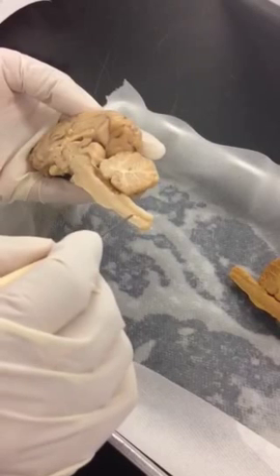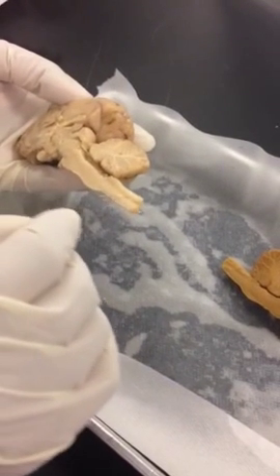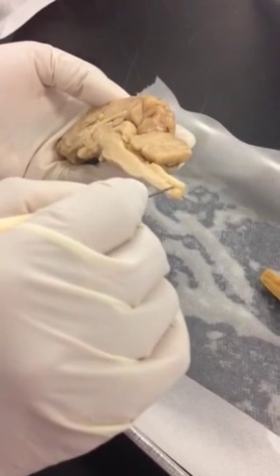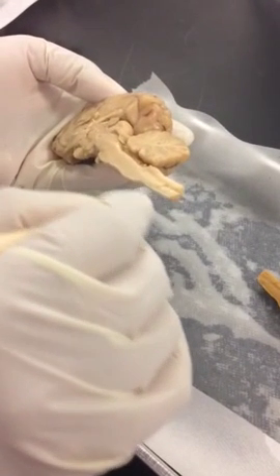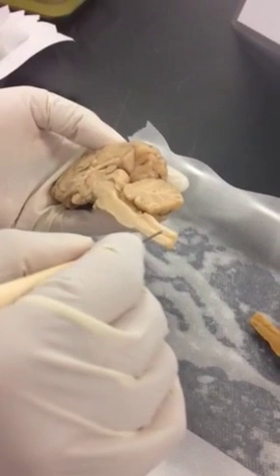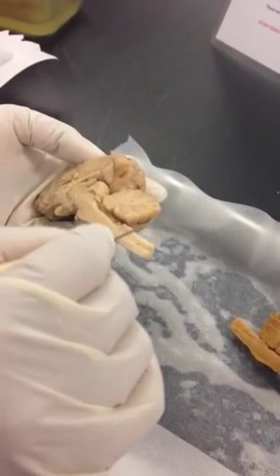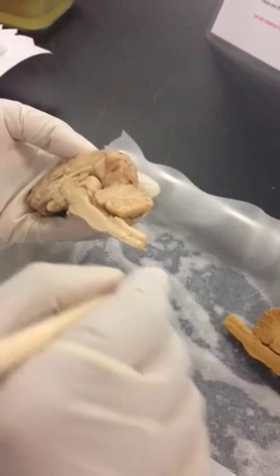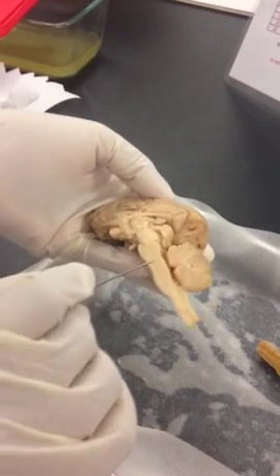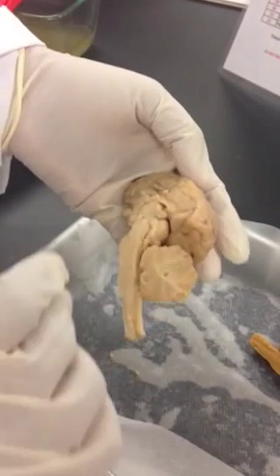And you can tell the spinal cord very clearly because you can see this thin line here. Can you guys see the line? That's supposed to be a little canal for the CSF to flow through, the central canal. This tells you the spinal cord starts here. Okay. So the rest is all your medulla oblongata and the pons and then the cerebral peduncle.